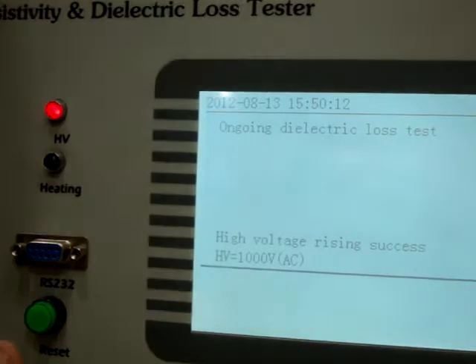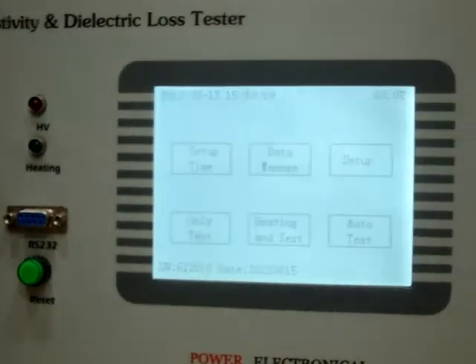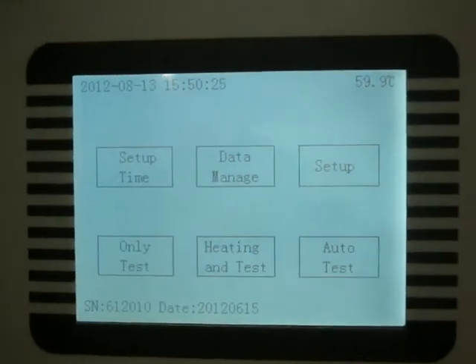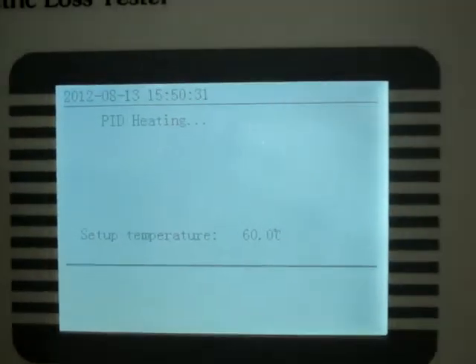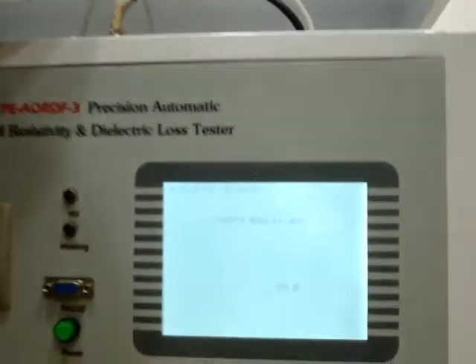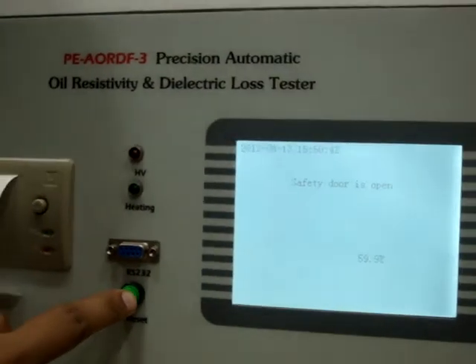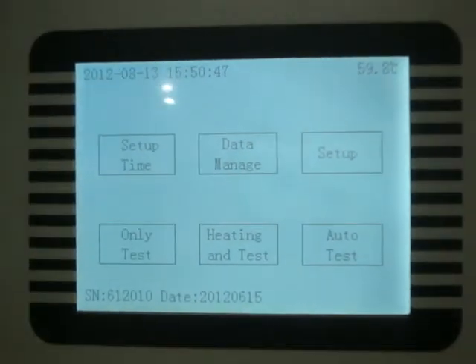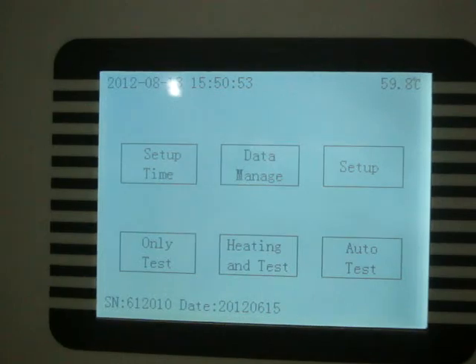In case of an emergency, always remember to push the Reset switch to return to the normal stage. If you have a test in progress and you open the door, it will display 'Safety Door is Open,' so it is very safe to operate. This protection is already built in. To clear the message, press Reset. Have a happy time using your oil resistivity and tan delta analyzer. Thank you.